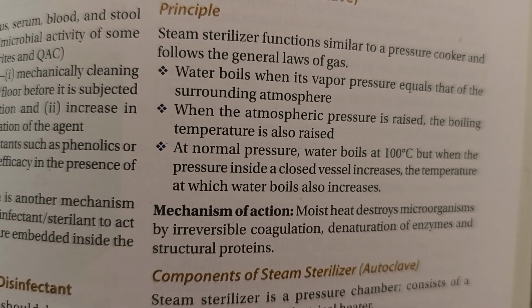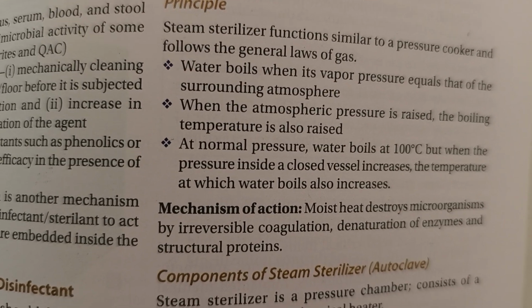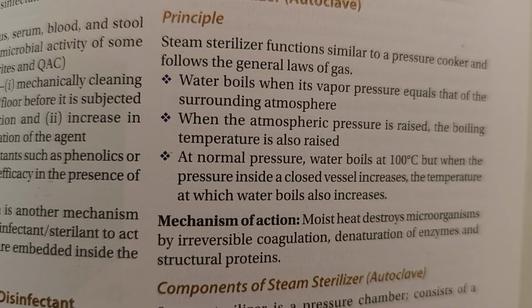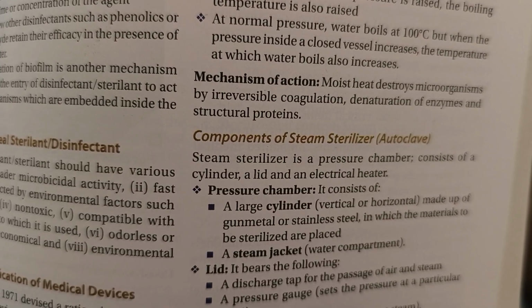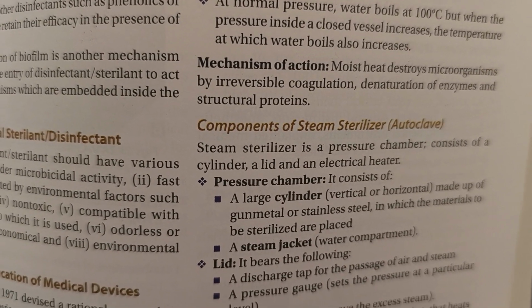Mechanism of action. Moist heat destroys microorganisms by irreversible coagulation and denaturation of enzymes and structural proteins. Components of steam sterilizer or autoclave. Steam sterilizer is a pressure chamber.